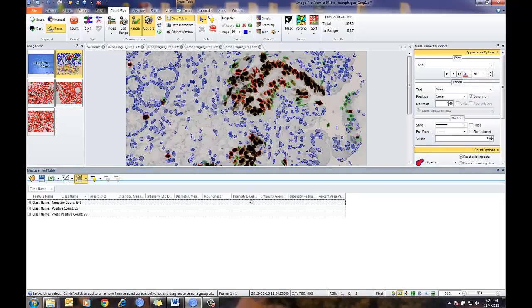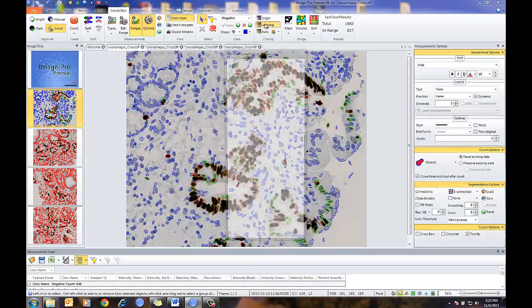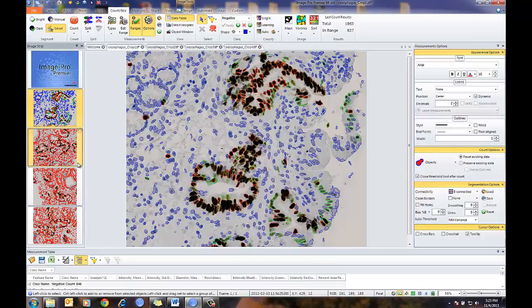Again, doing the assay for this particular experiment, normally I would have regions of interest around the structures, or I would have used, for example, a cell analysis app to automatically find those and only count within those regions. Now, the next part is, once I've created that, I can go set global. As you can see by the directions in the tooltips, I now want to use this on multiple images so I can refine this or apply it to other images. So I'm going to close it, go to another image.